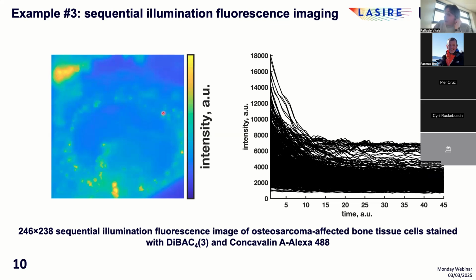Clearly, before ParaFac-ALS processing, this image was preliminarily unfolded pixel-wise, which resulted in a three-dimensional data structure of size 58,548 pixels times 6 photo-bleaching photo-recovery cycles and 45 time points, assumed once again to exhibit trilinearity among the pixel, the cycle, and the time mode.